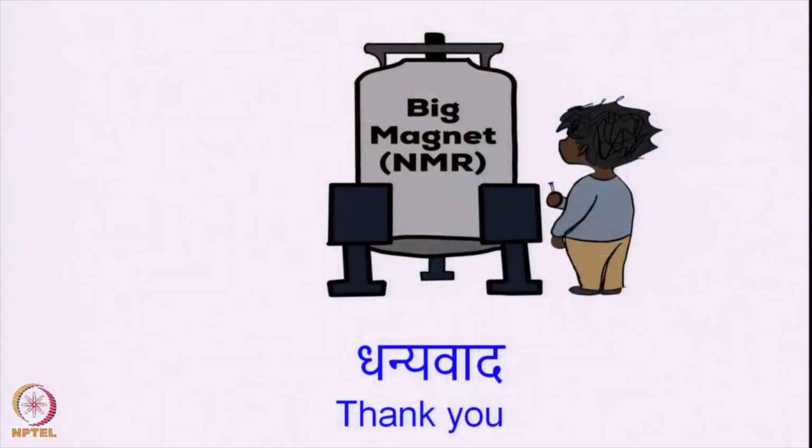At the end I would like to thank you. All those things that we discussed are related to this big magnet and this beautiful technology called nuclear magnetic resonance. As a curious student, you have to stand in front of the magnet with the sample, and you can do structure, you can do dynamics, you can get shape and size, you can do lots of biopharma studies, chemical pharma studies. This technique is going to open many avenues for you in future.